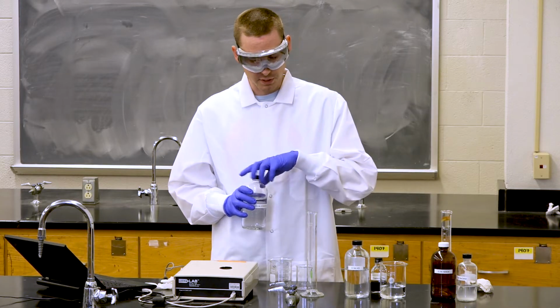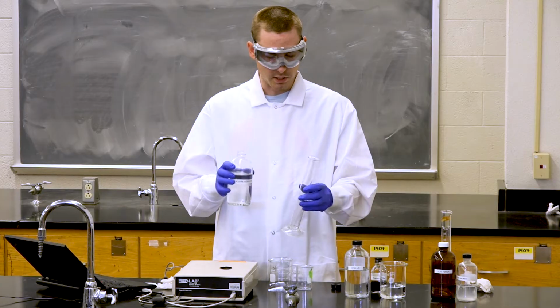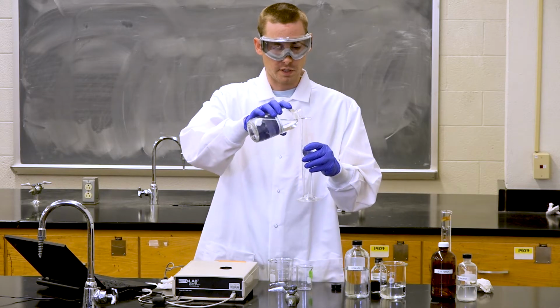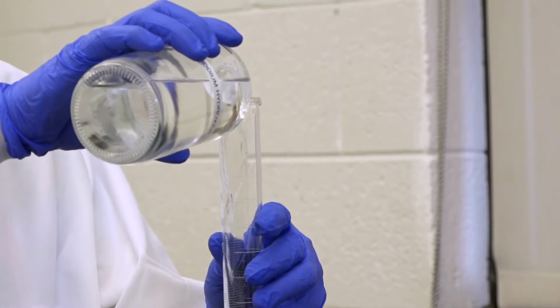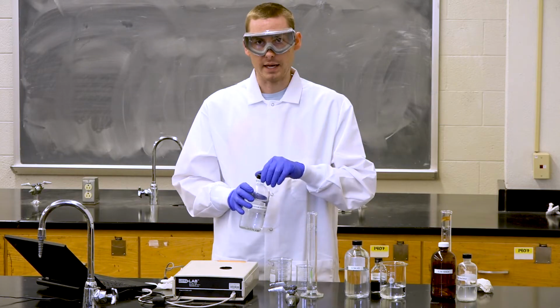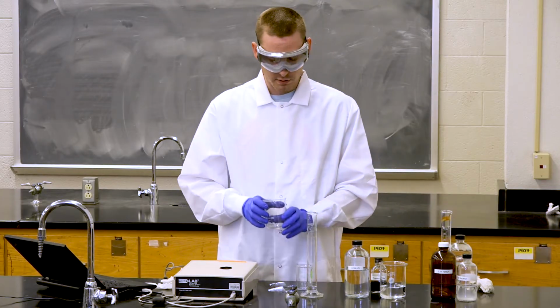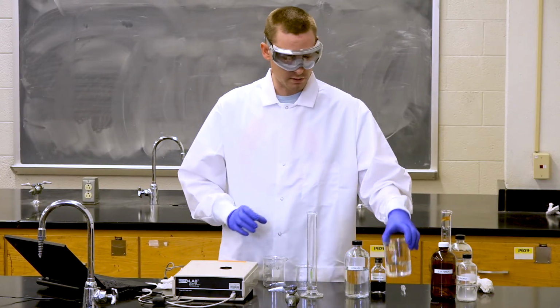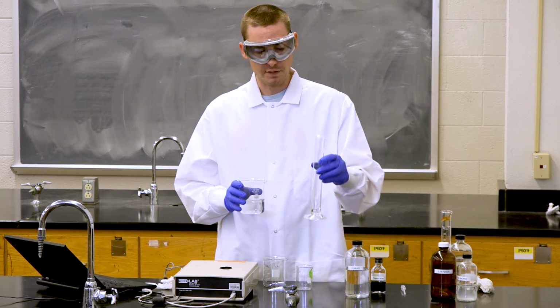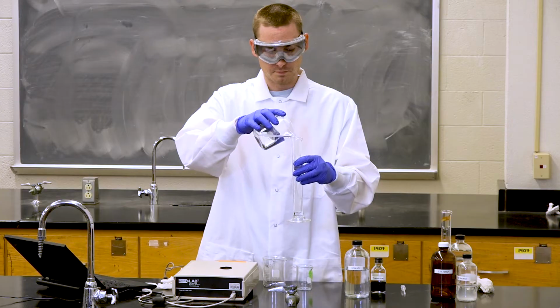So we'll use a graduated cylinder and first add 5 milliliters of the sodium hydroxide to the graduated cylinder. We can then add 45 milliliters of deionized water, or up until the 50 milliliter mark on the graduated cylinder.